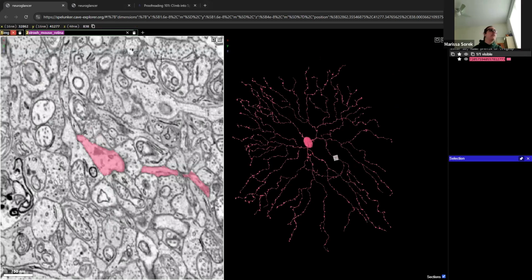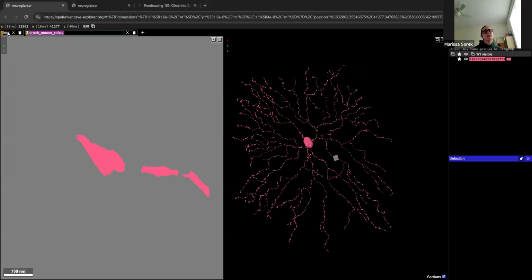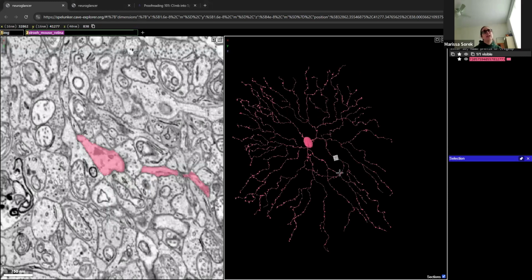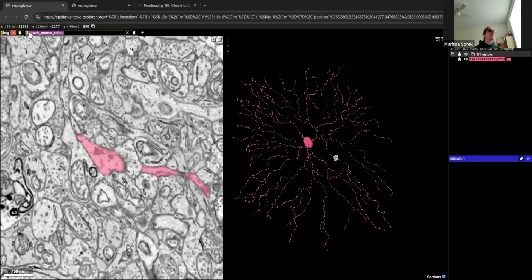For each of these, they correlate with these layer tabs up here. So this layer tab here is with our EM image. If we left click it, it shows hide it. And the same goes with the segmentation layer here. That is the coloring in our 2D and also our 3D model here. You'll notice when I left click, it does show hide it. So to select that particular tab, you're going to right click.